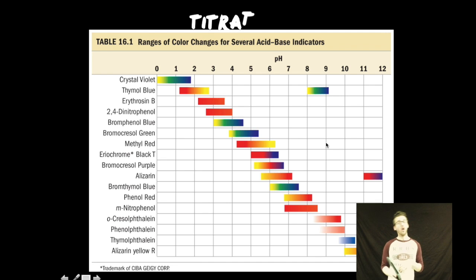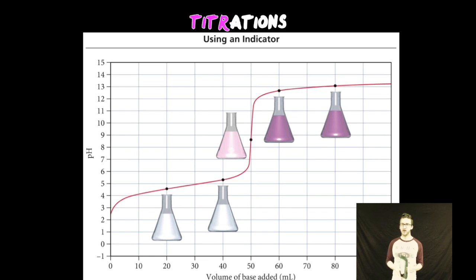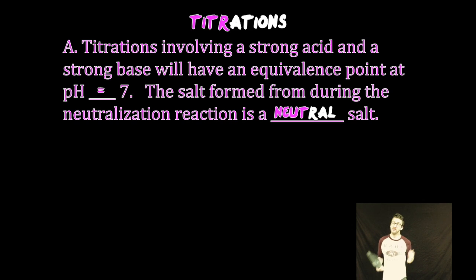And again, there's a whole host of acid-base indicators. We've used a couple of these already, like bromthymol blue, each of which change color along a different pH range, and will be selected depending on the type of acid-base titration that you're working with. The important thing to recognize, though, is that you want that color change to happen at approximately the pH of your equivalence point. Okay, last couple of things to think about here as you think about titrations.